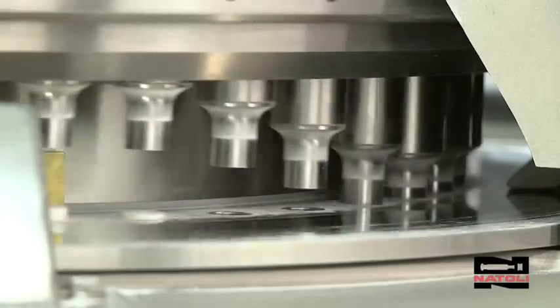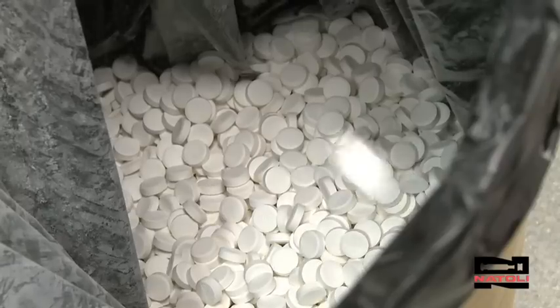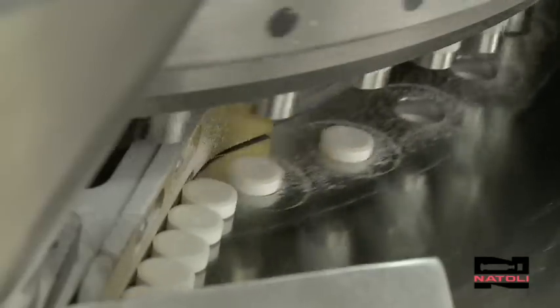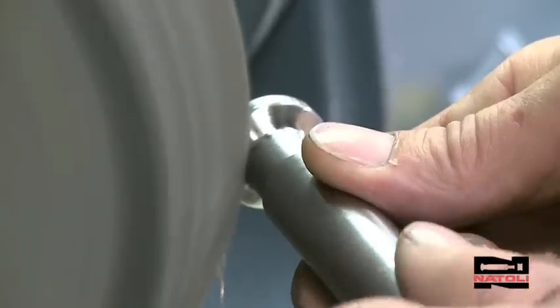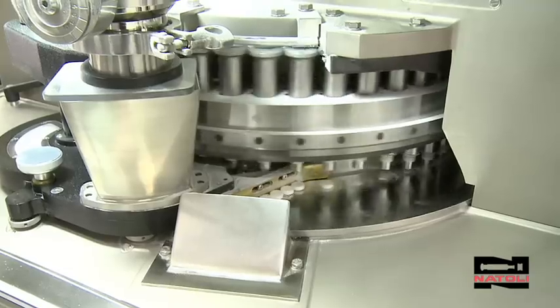Ever wonder how the experts keep their presses running and tablets consistent year after year? After 35 years in the business at Natoli Engineering, we know the key is well-maintained tooling. Your tools are an investment, and refurbishing, polishing, and maintaining tools is vital to keep producing quality product.